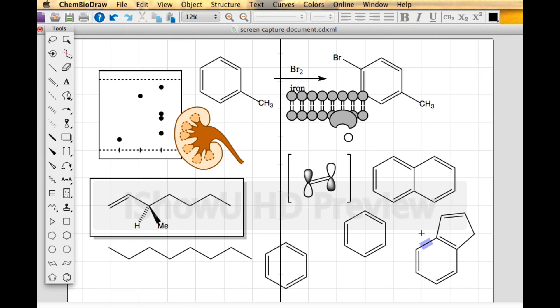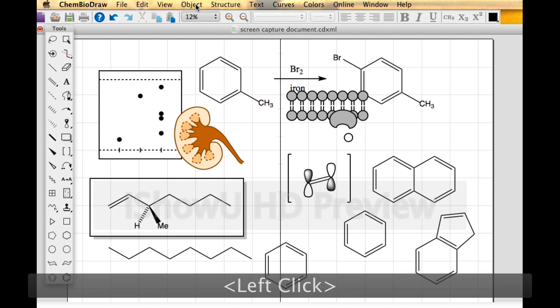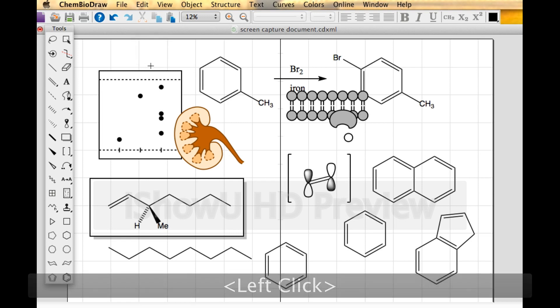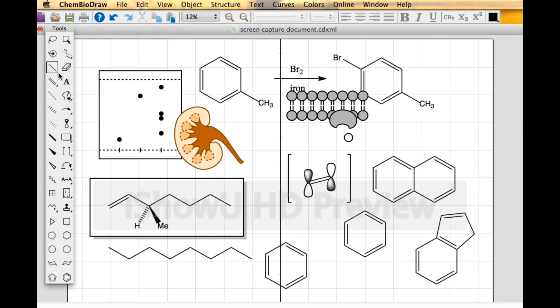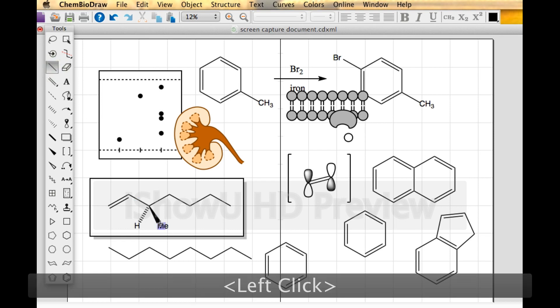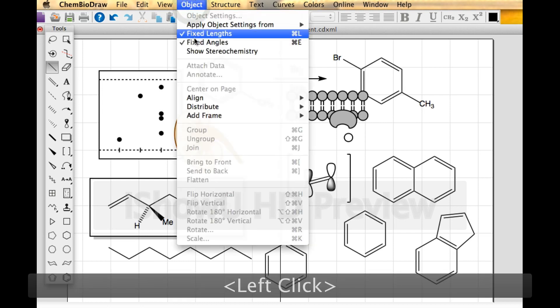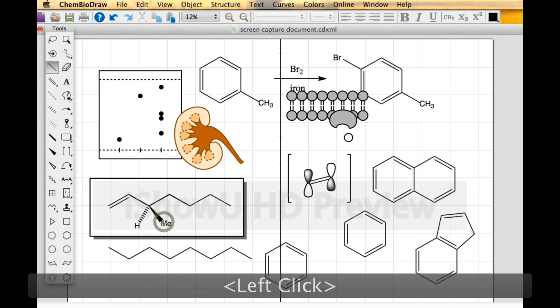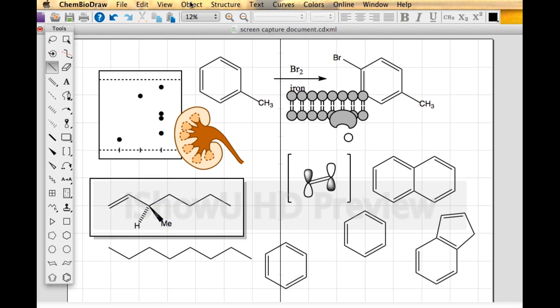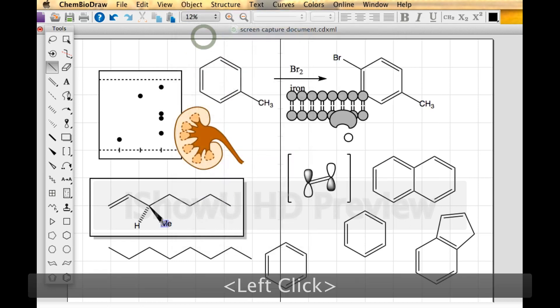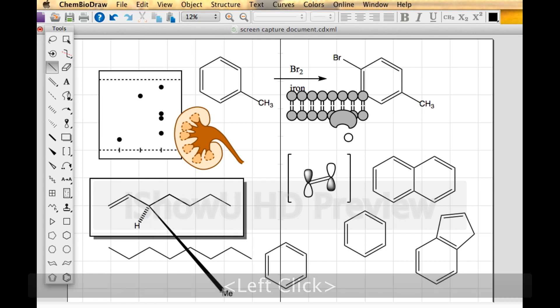Two other useful things: right now the program has object fixed lengths and fixed angles turned on. This is okay for drawing most things, but suppose you didn't like the angle a methyl group is at — get the bond tool, hold down the shift key, and you can move it. You can only move it to certain angles and lengths. If you turn off fixed angles, you can move something precisely to the angle you want. If you turn off fixed lengths, you can move it precisely to the length you want.